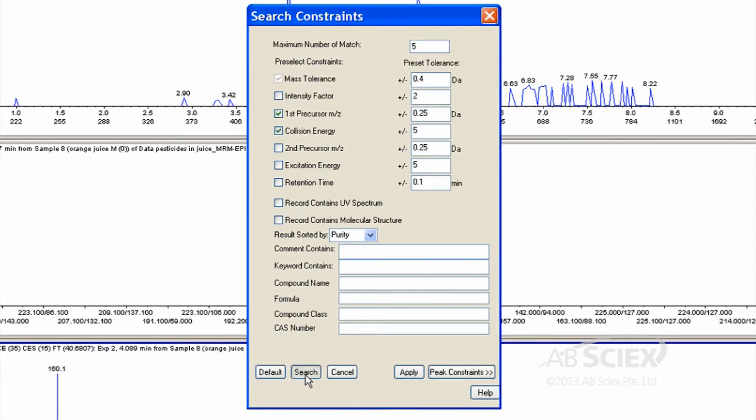Note that you only need to set up these library search parameters once. They will default to the values you enter for each subsequent library search. That means for any later searches, you will just need to right-click in the EPI Spectrum pane and select Search.